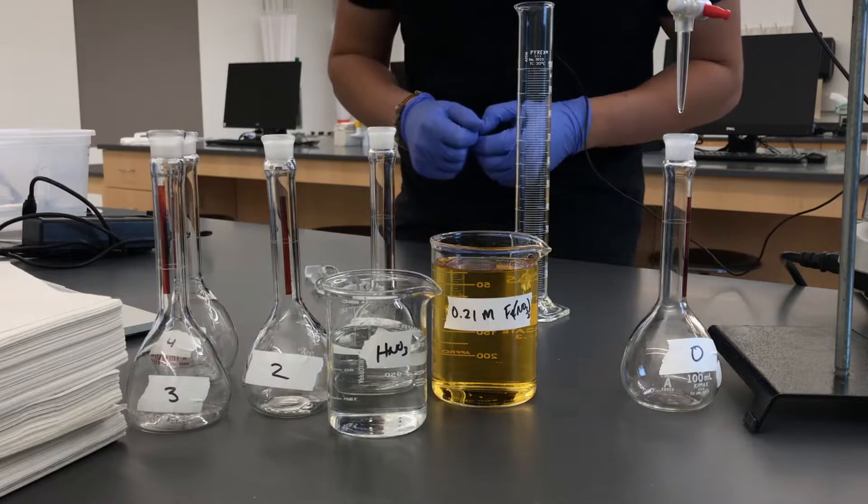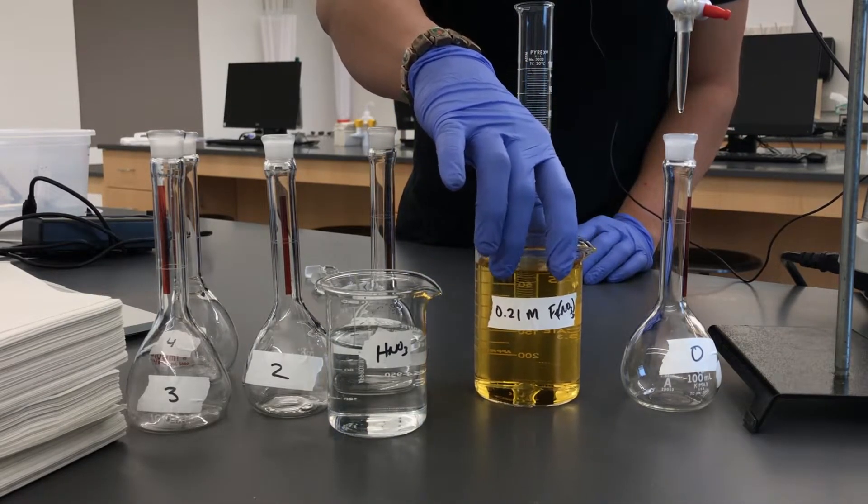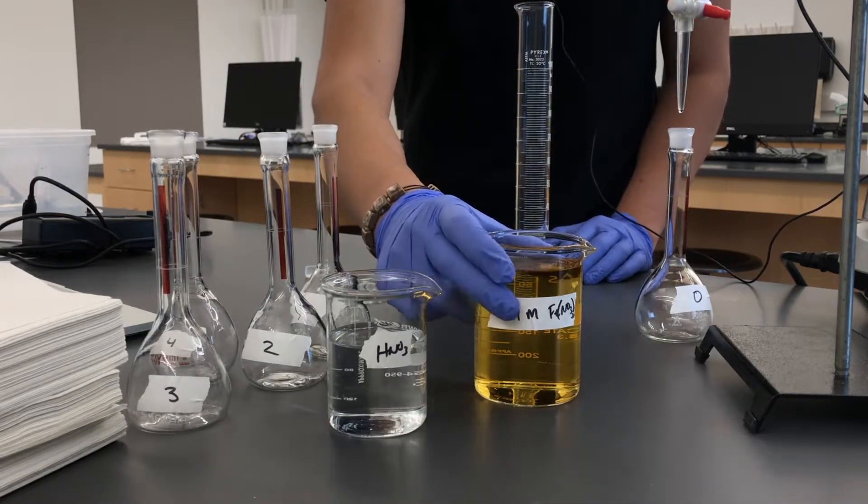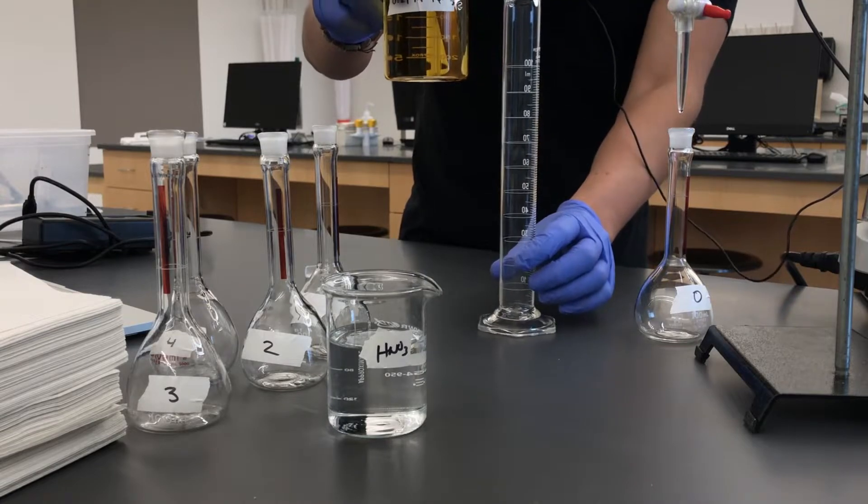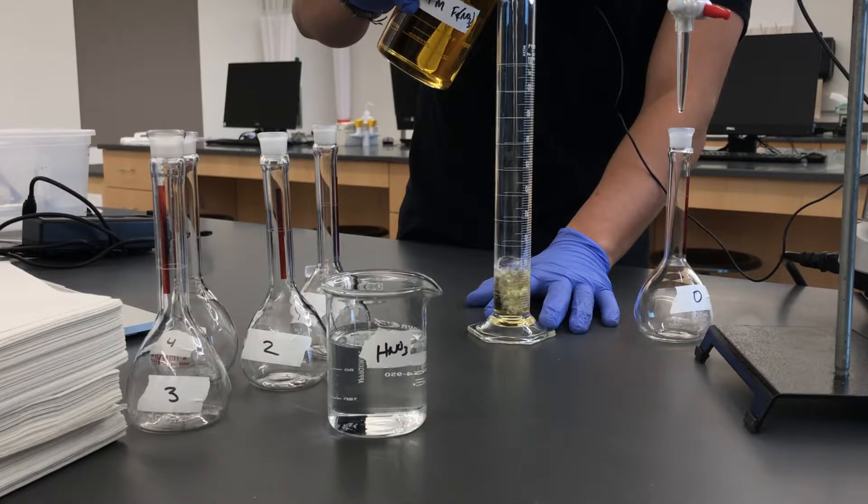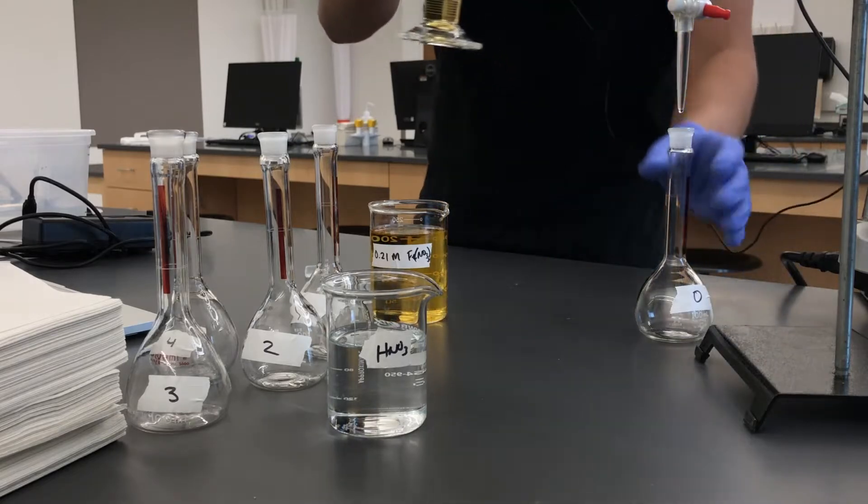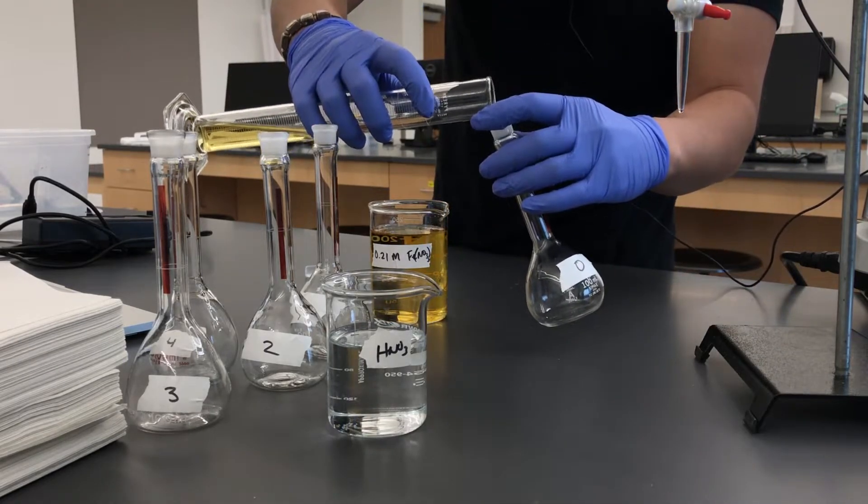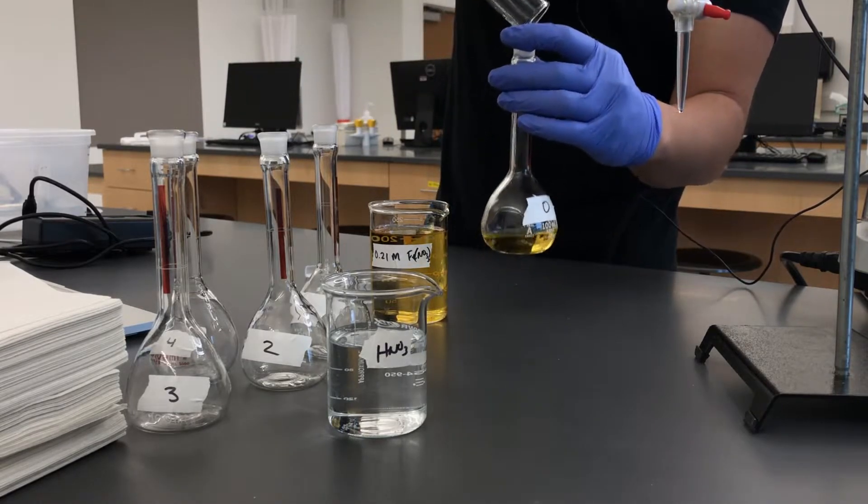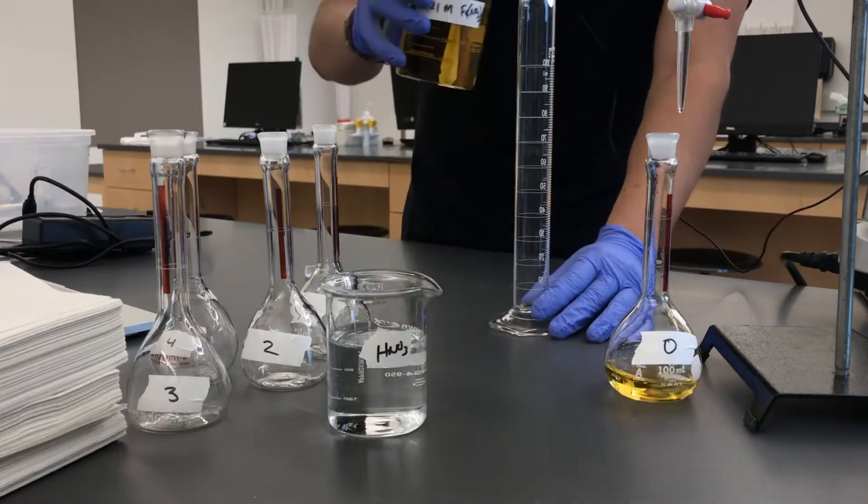First thing we've got to do is add about 25 mils of our ferric nitrate to each of the five volumetric flasks. So the easiest way to do that is going to be to take some of this ferric nitrate and measure out about 25 mils in the graduated cylinder. That's pretty good. Let's add it into the first one which is our 0 and then we'll repeat for the other 4.